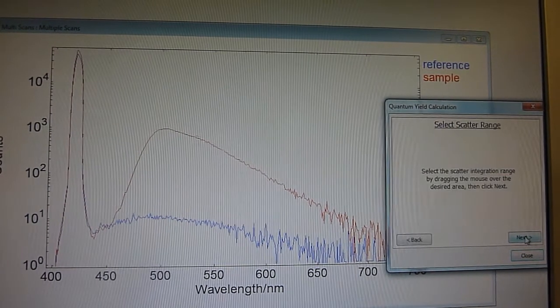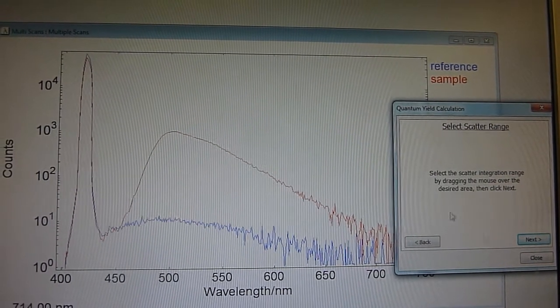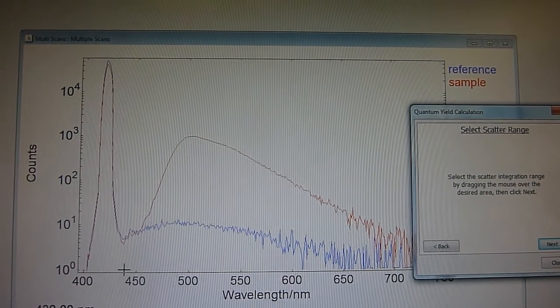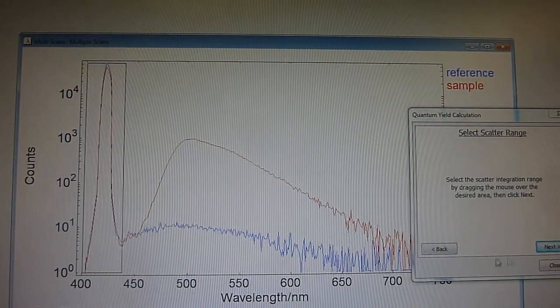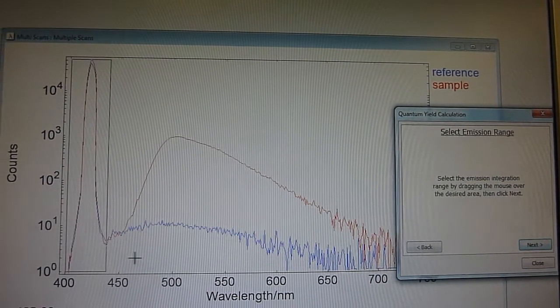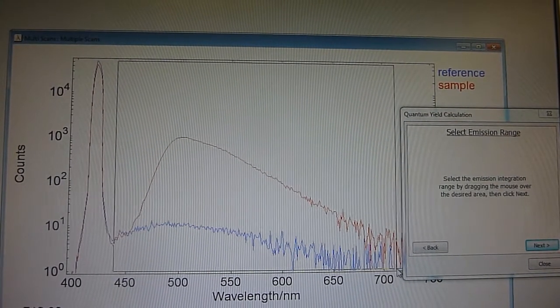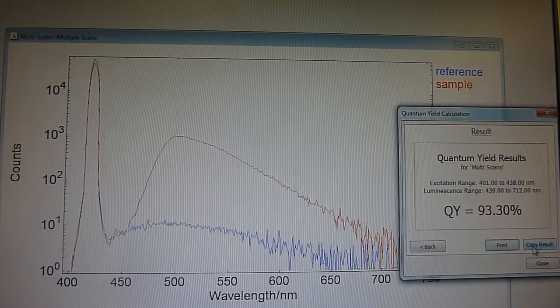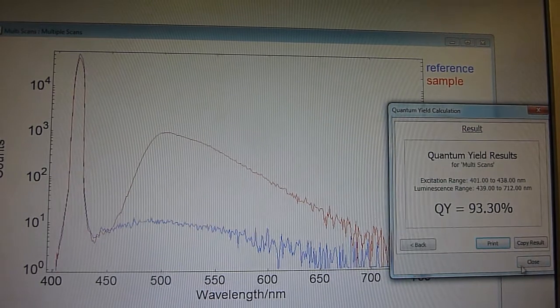So let's now click next. And now it's asking me to select the scatter range. So I'll just kind of click over here. That's about right. I'll click next. Now it's asking me to select the emission range. So I'll select this region here and I'll say next.